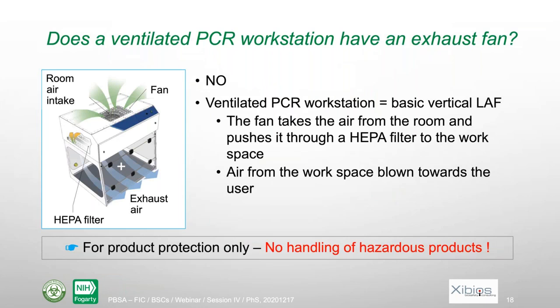When I presented briefly the PCR workstations, I told you that there were two types, a static one with no ventilation and a ventilated one. And so the question here is, does a ventilated PCR workstation have an exhaust fan? Actually, no. And I put here a kind of schematic view of such a ventilated PCR workstation.